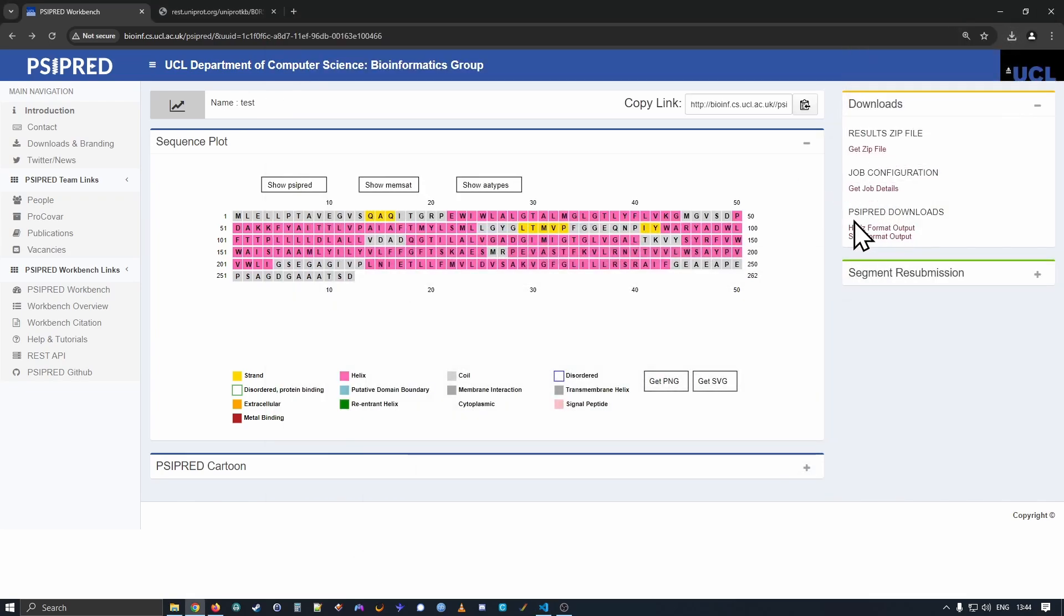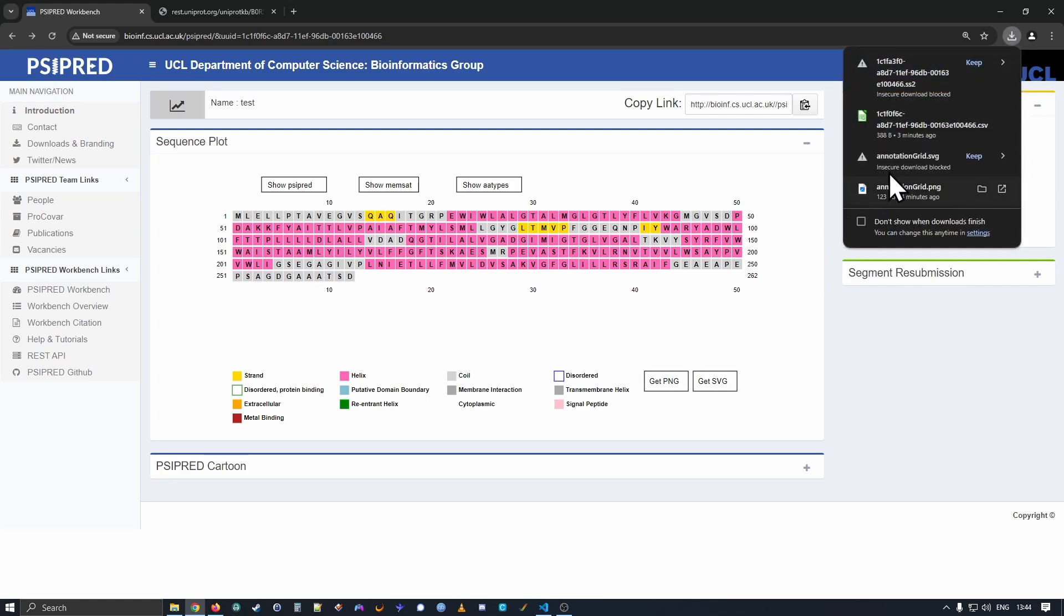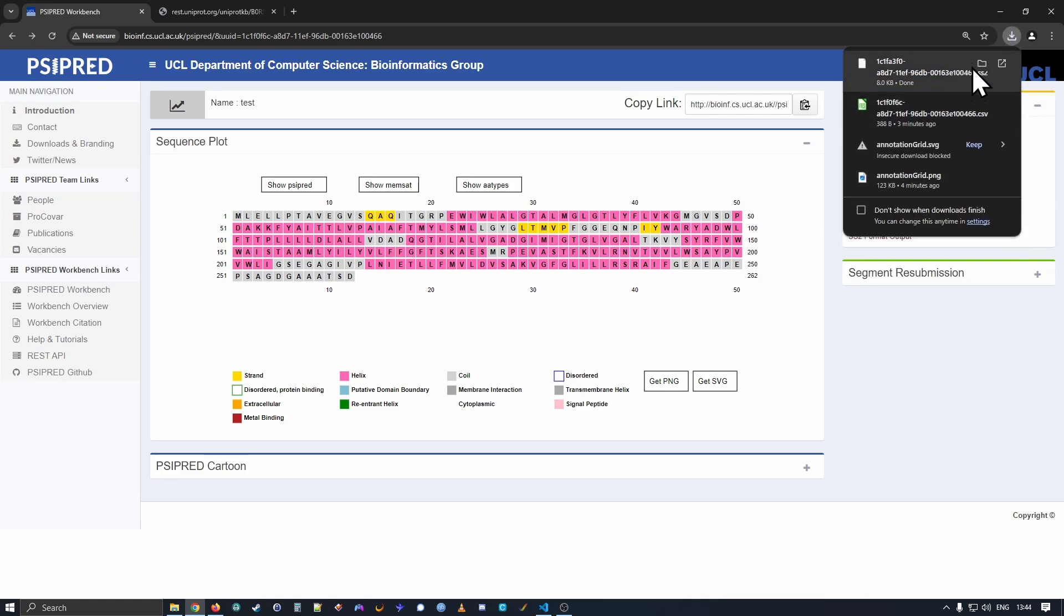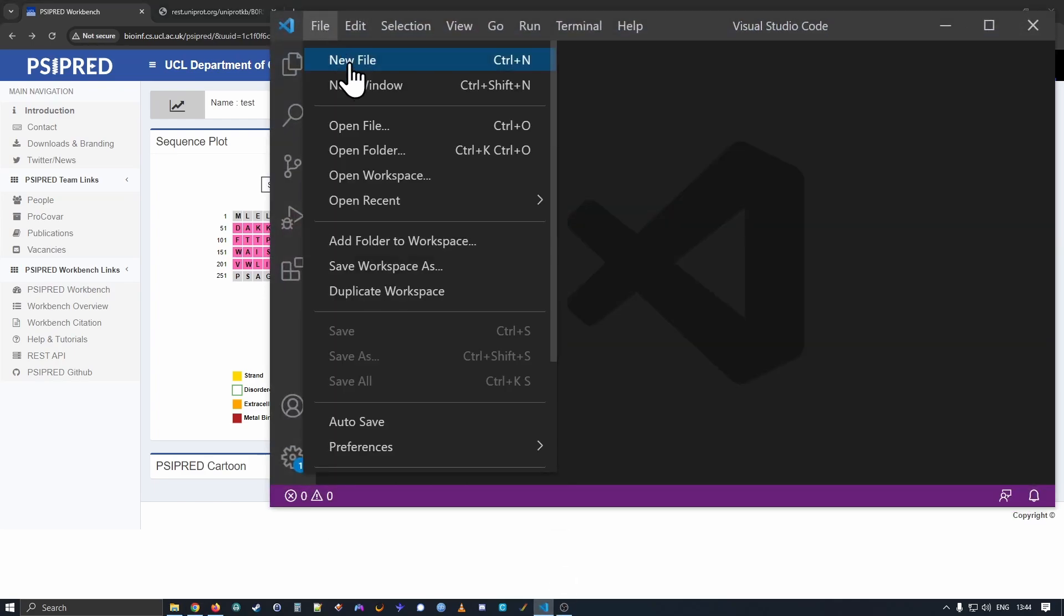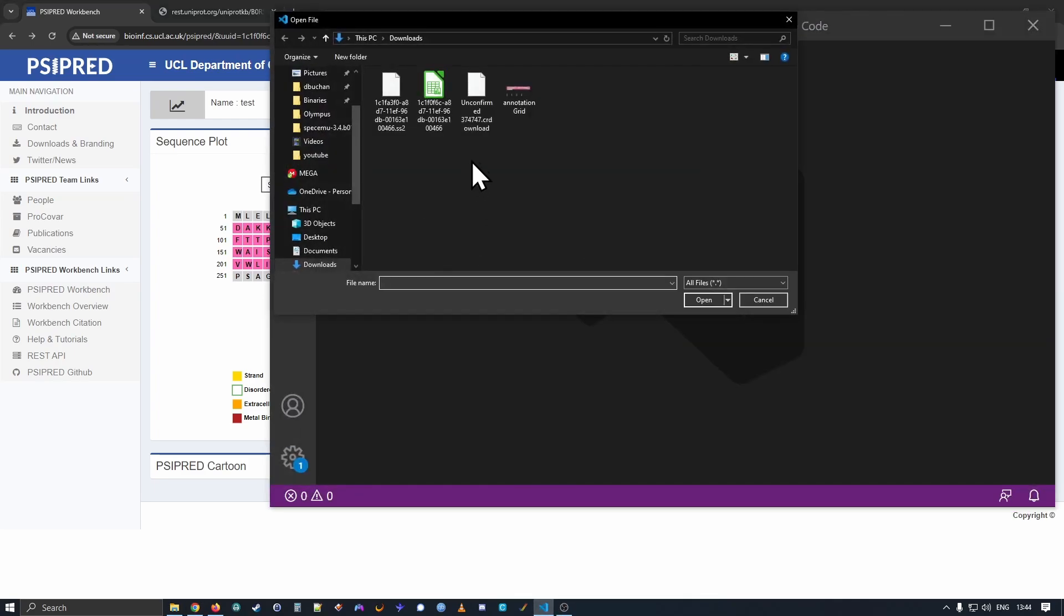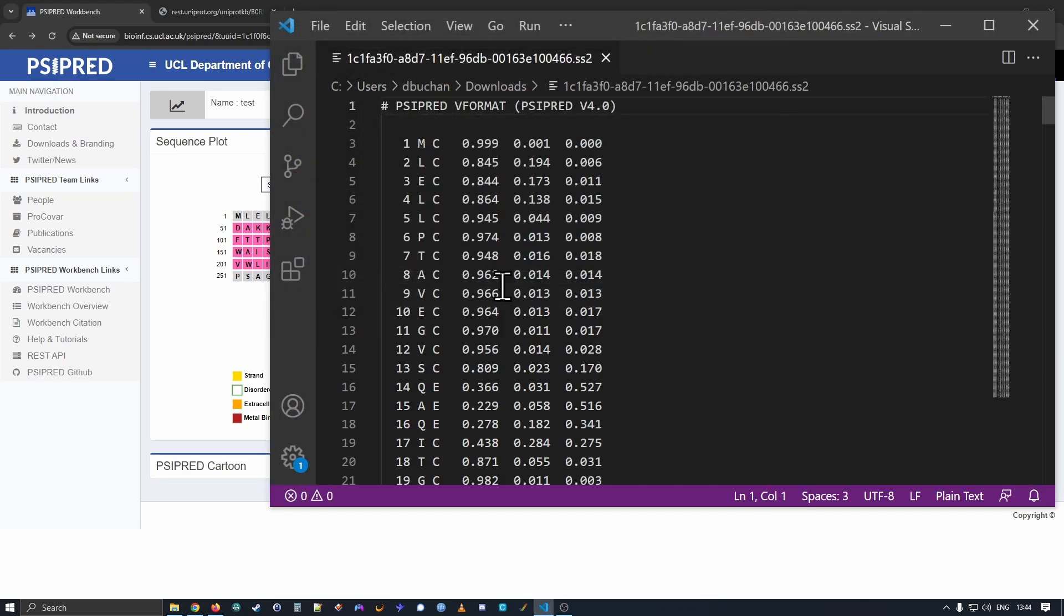Working down, PSIPRED downloads. So the SS2 format. So if I open the SS2 file.